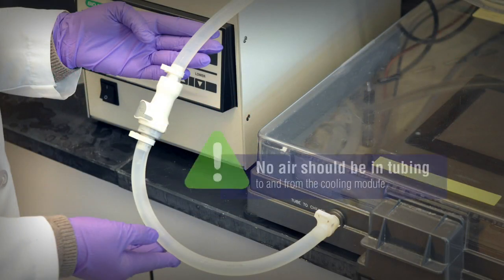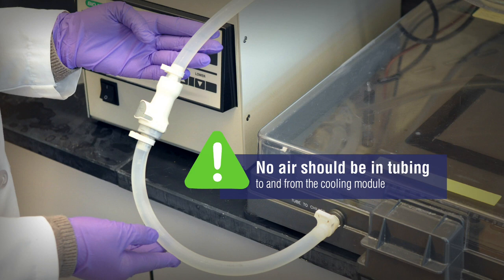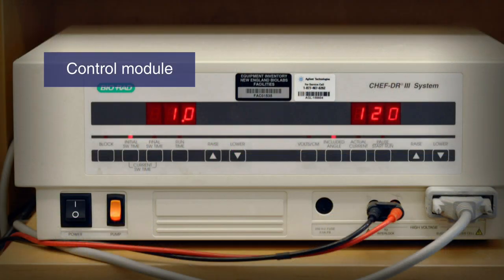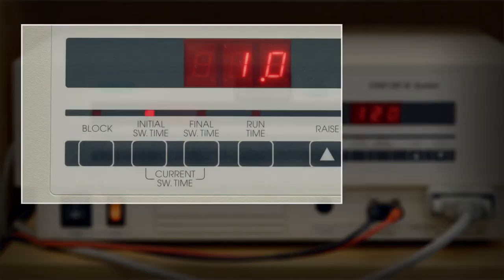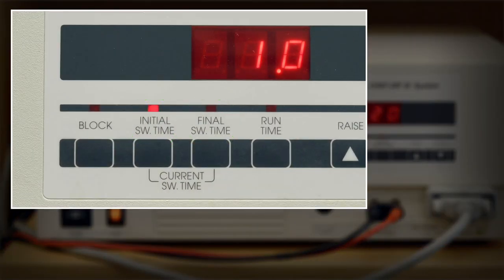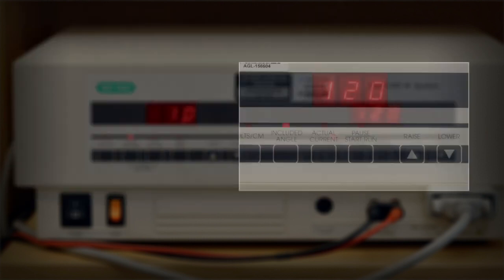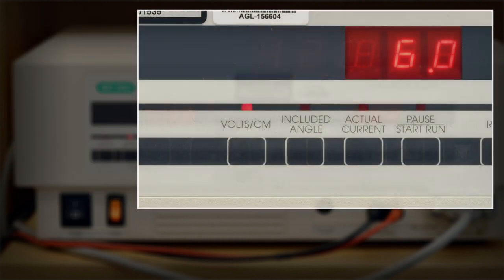It is important that no air is left in the tubing to and from the cooling module. On the control module, the migration protocol can be entered and monitored. This includes the initial and final switch times, the duration of the migration, the angle of electrophoresis, and the voltage.